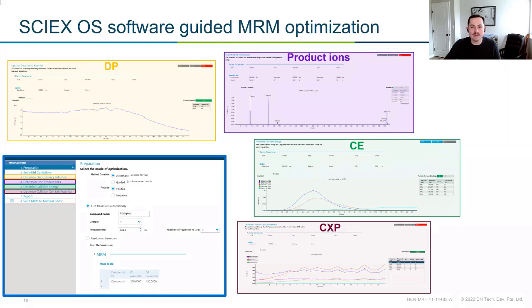And that can be a little bit confusing sometimes for softwares because they might think, hey, that spike is actually the most intense point. And really, it's just an artifact for me not doing a good job getting bubbles out of my syringe. So if you do choose one of these automated approaches, just go ahead and give it a glance over, make sure you're still paying attention and using some of the rules we talked about to decide if this data is good data.